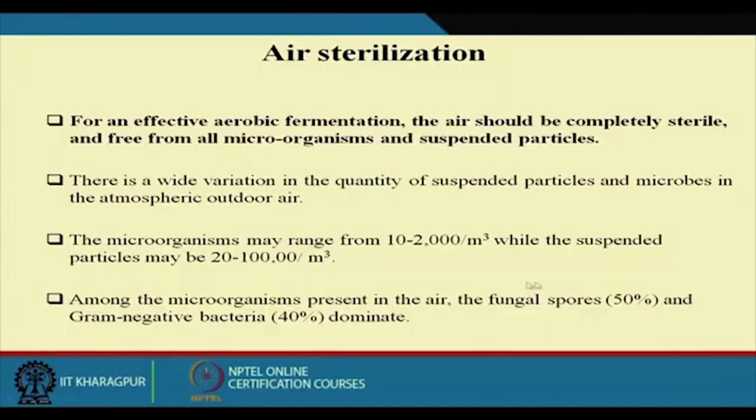So the question comes, how will we sterilize the air? For an effective aerobic fermentation process, air should be completely sterile and free from all microorganisms and suspended particles. There is a wide variation in the quantity of suspended particles and microbes in atmospheric outdoor air.